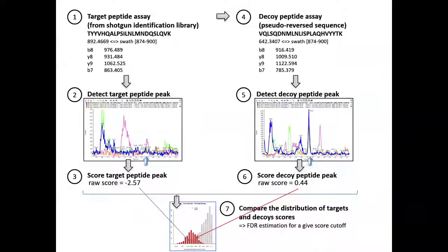Yeah, just on that idea, obviously, if there is a palindromic peptide, you can search to make sure it's there if it's reversed. But what about all of the non-unique peptides that we kick out of the library anyway? All of those shared peptides, if we're reversing or shuffling, should there be a BLAST that we do to make sure that we're not actually... You mean they're non-proteotypic, so they are shared across proteins? Yes, shared across proteins. So you're saying you could have a decoy that looks like another target? Is that what you mean?